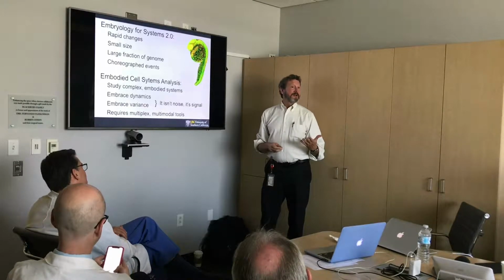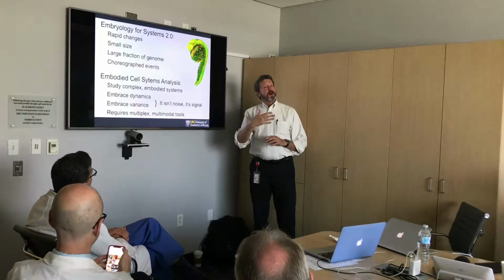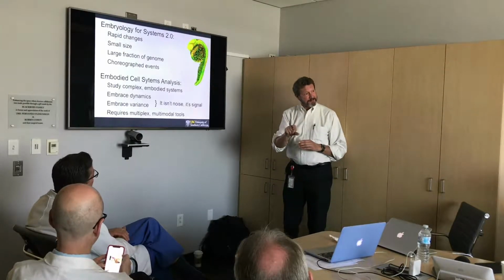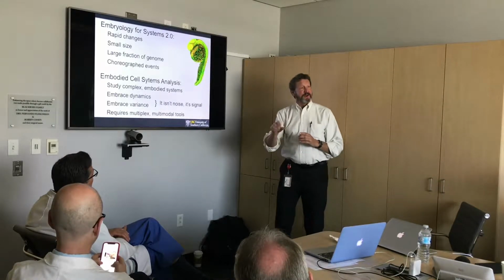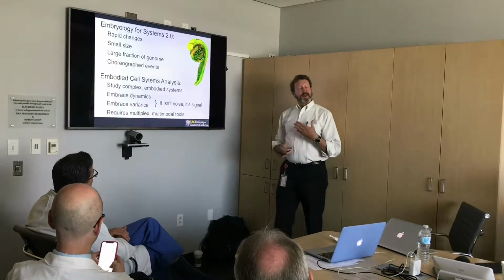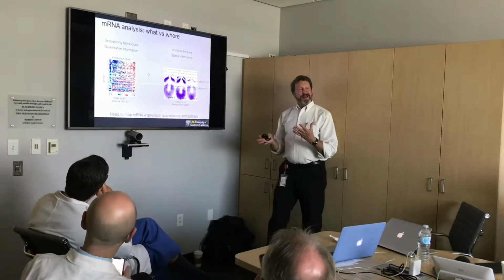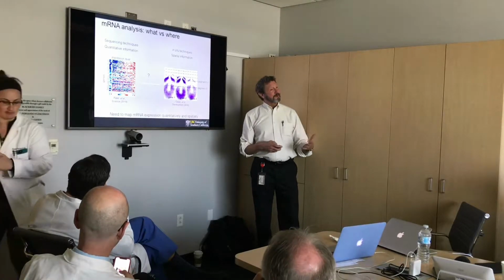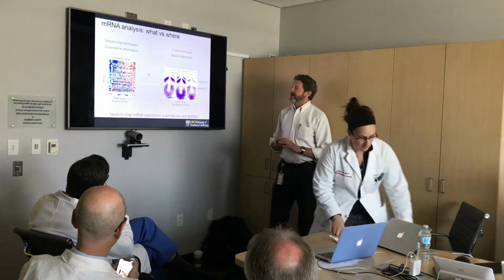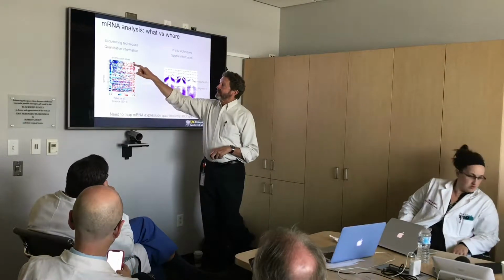And the way that we've been trying to get around that problem with variance is to study the same sample over time, and the same sample with multiple imaging modalities and looking at multiple labels, so that variance and what co-varies with it becomes the signal rather than the complication. And so I thought I'd tell you a little bit about the dead imaging and then a little bit about the live imaging. The dead imaging is our attempt to do spatial genomics and spatial proteomics by doing quantitative visualization of proteins and RNAs. And we've got tremendous ability now, even down to the single cell level.